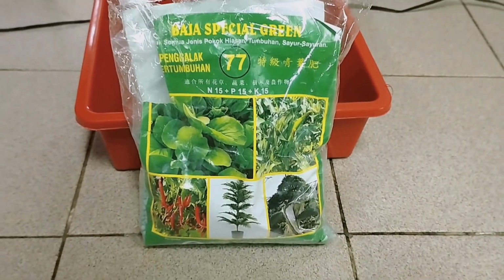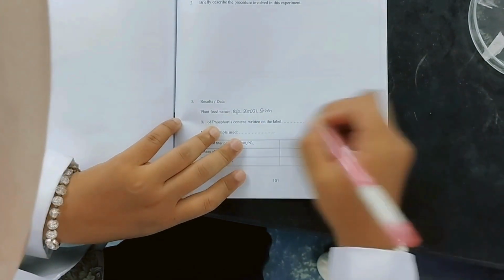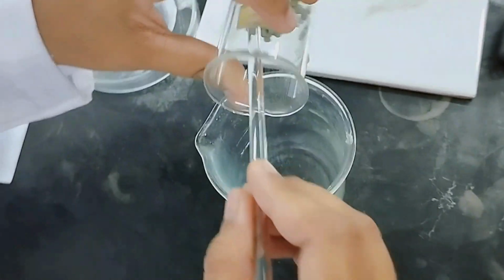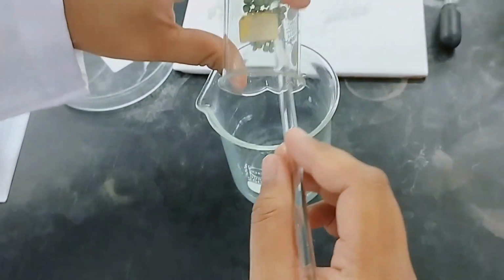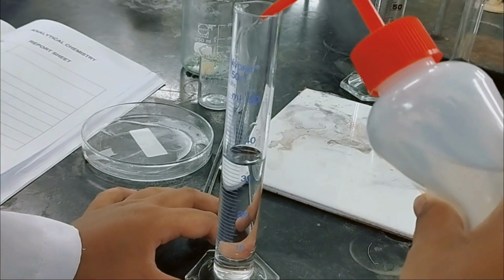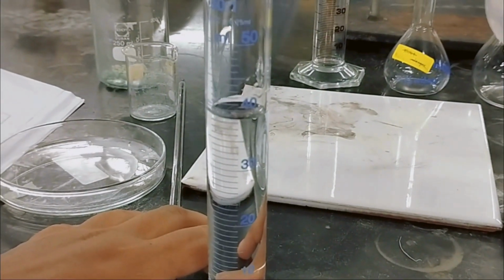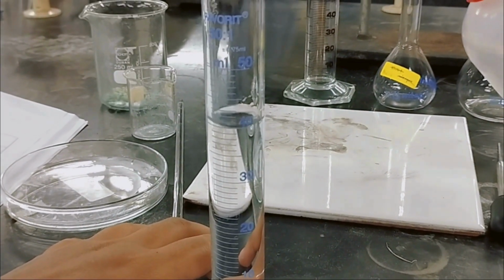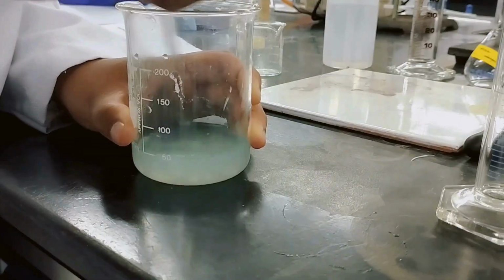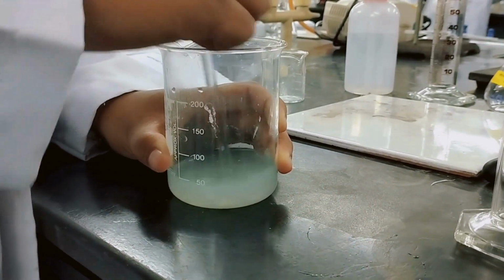Obtain your plant food sample and record all the information written on the label. Weigh 3.6 gram of plant sample and transfer the sample to a 250 ml beaker. Add 40 ml of distilled water and stir the mixture. If the sample does not dissolve, remove the insoluble material through filtration.